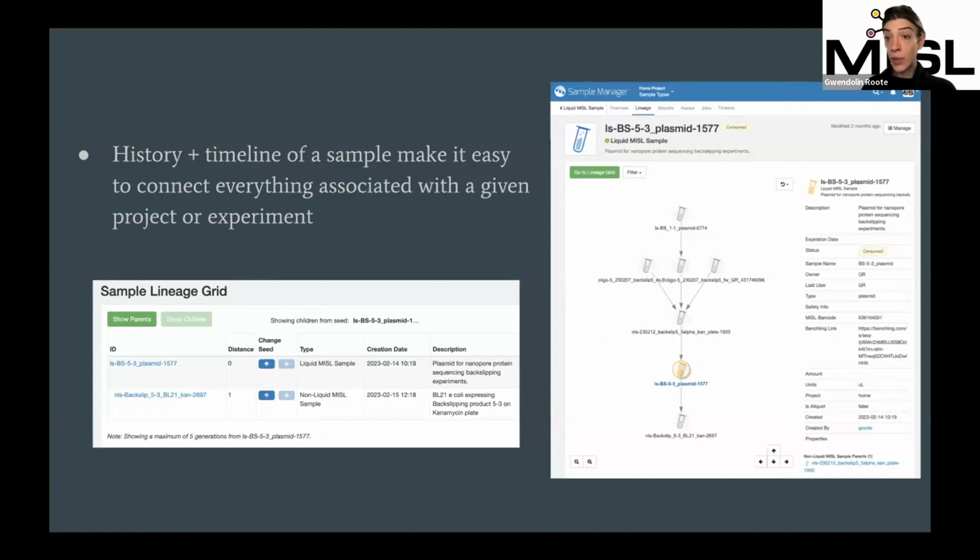So we might design a protein based on DNA or protein sequence on a tool like Benchling. And then in the lab, it goes through a lot of steps to get that from a piece of DNA into an actual protein that we can use. So it starts out as like some pieces of synthetic DNA, then we'll have to amplify a plasmid, stick in our new region, that's a different sample.